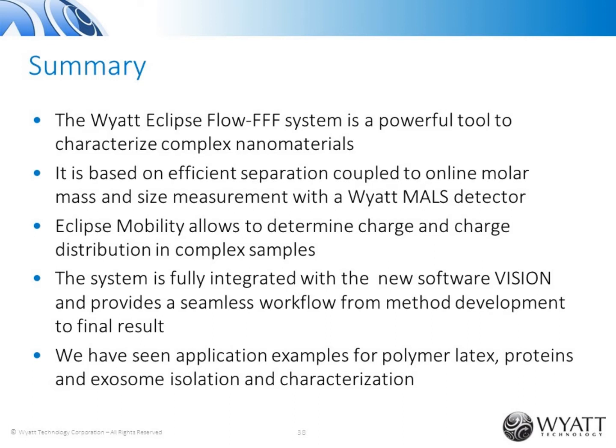Okay. Can you comment on the upper size limit for charged particles? Well, the upper limit really depends on what we can separate in normal mode in field flow fractionation. Once we reach very big particles, steric effects come into play, and then the shift in retention time probably will not be good enough to calculate a reliable electrophoretic mobility number. So again, it depends on the sample and experimental conditions, but I would think up to 400 nanometer radius should work, but not bigger.